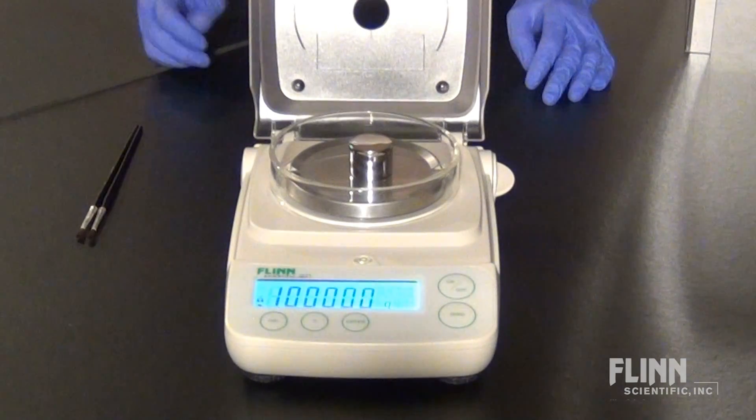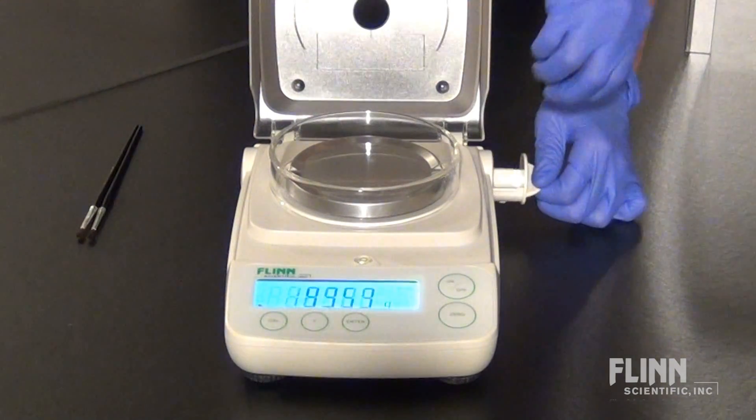Milligram balances should be recalibrated at least once a month and each time they are moved.